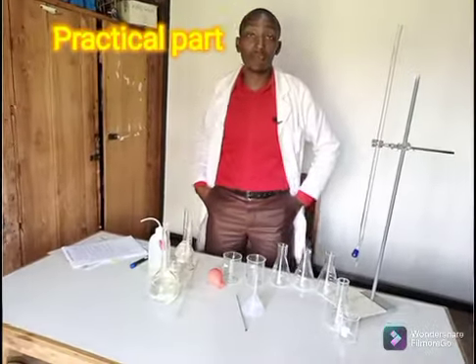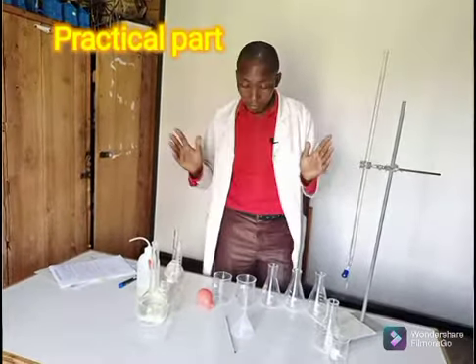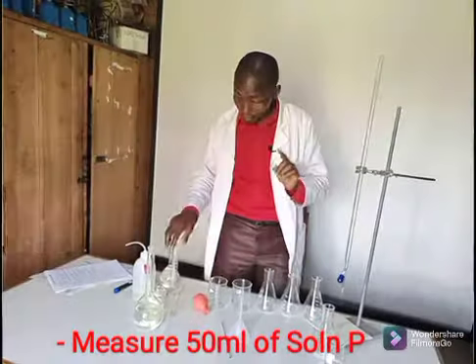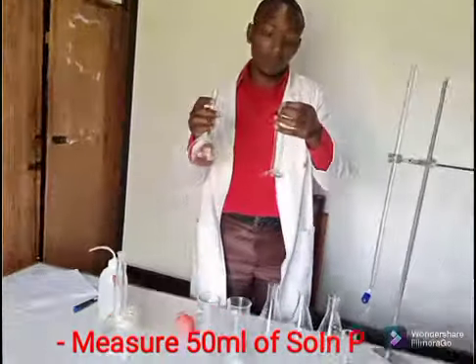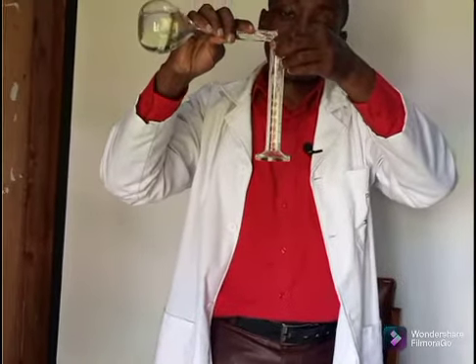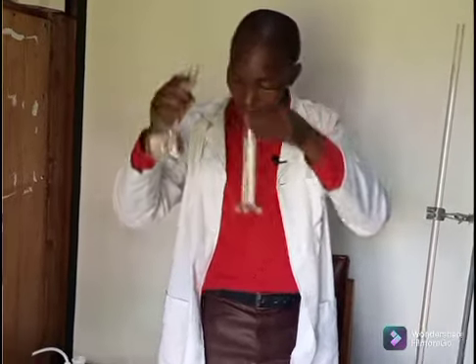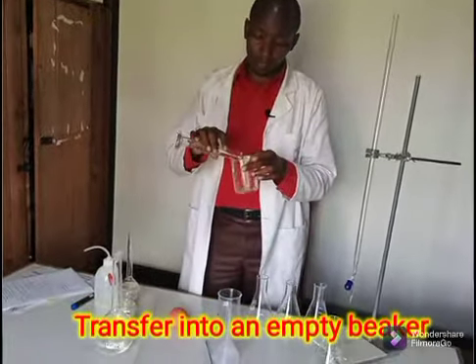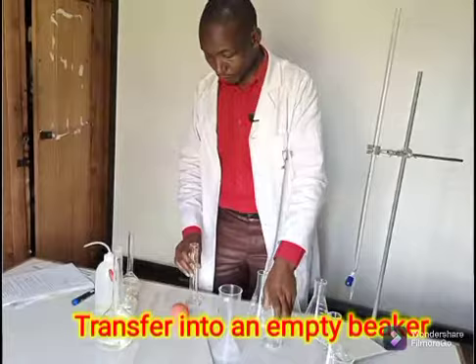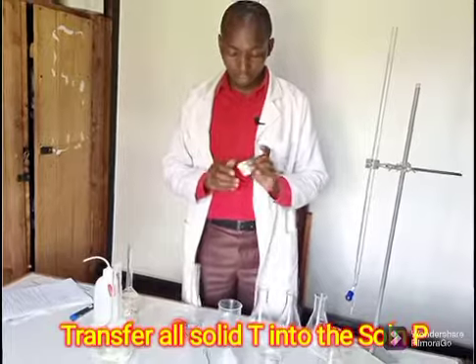Now I'm very much prepared to do the practical part. Step number one, I'm supposed to measure 50 centimeters cubed of solution P. So I have the P. I will do 50. So exactly I do 50 of solution P. Exactly 50. Yes. With the 50, then I transfer it into an empty beaker. So I have 50.